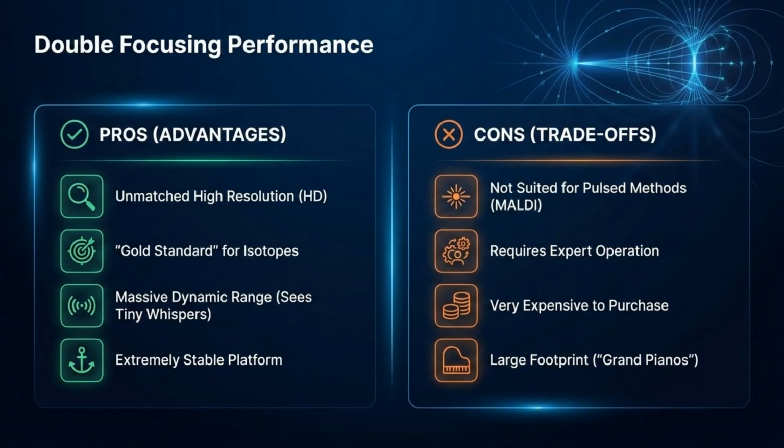Why doesn't everyone use this? These instruments are the grand pianos of the lab. They are physically huge and very expensive. But if you are doing carbon dating where every decimal point matters, this is the gold standard.